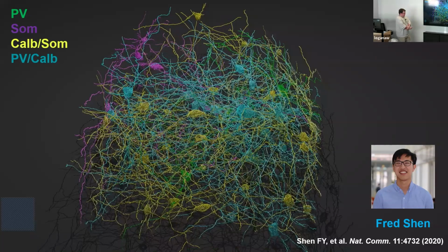Oh, I see. Yes. How do you know you did it right? That's a great question. The answer is mostly qualitative. If you look at the data and you have a neuron, and it goes like this, and then you reach the edge of a tile and it goes like this and it breaks, that tells you did it wrong.